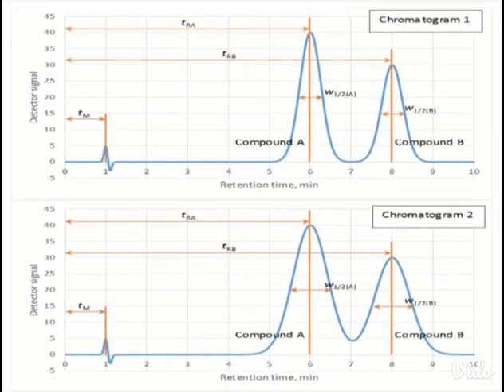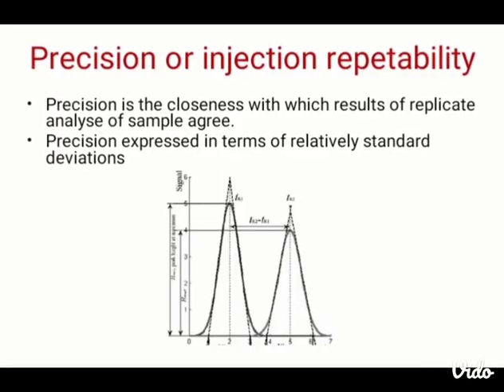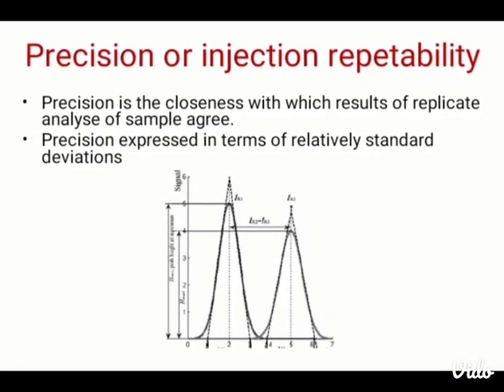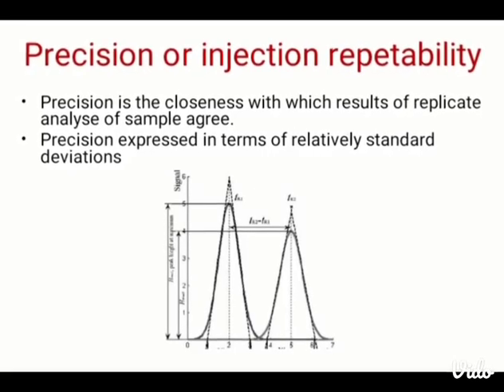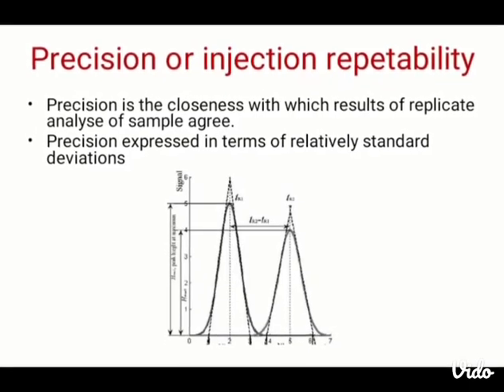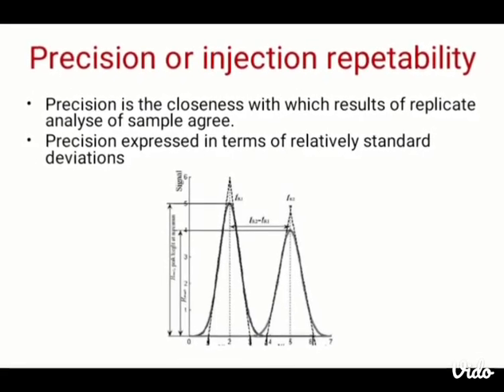So the capacity or retention factor completely depends on the retention time of the analyte and the retention time of the mobile phase. The formula is given as k = (tR - t0)/t0. There are high k values and low k values. This is how we interpret k, the capacity or retention factor.